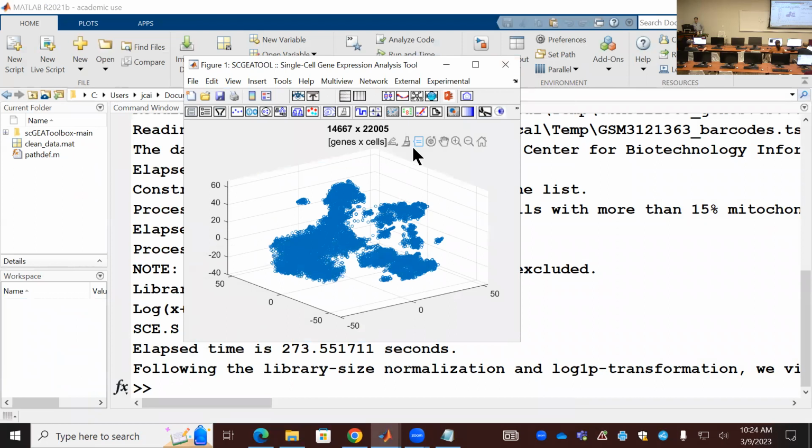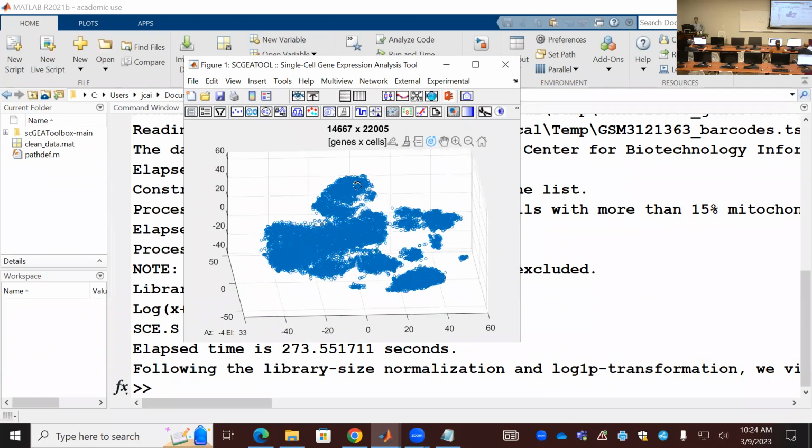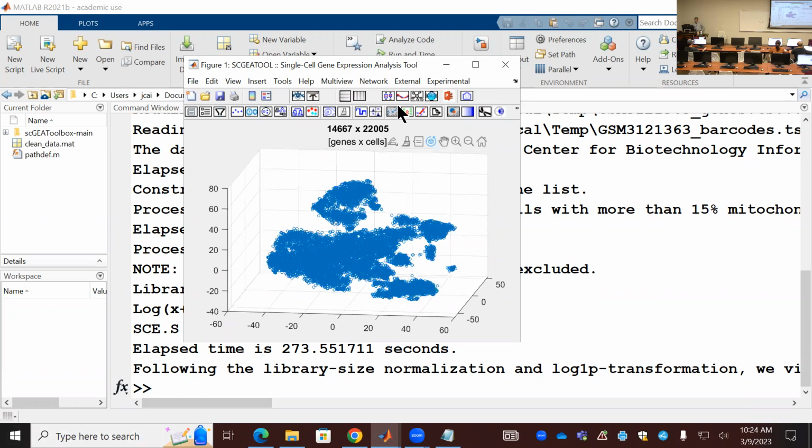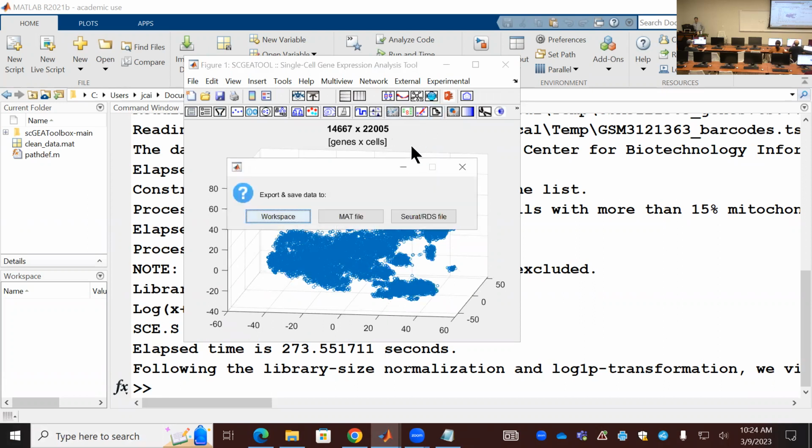Okay, the t-SNE embedding is finished on my machine. Also, the installation of miniconda is finished. At this stage, I'm going to save this file, just in case the computer crashes because of memory use, so I don't have to re-download the file.